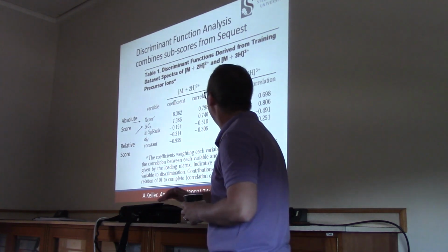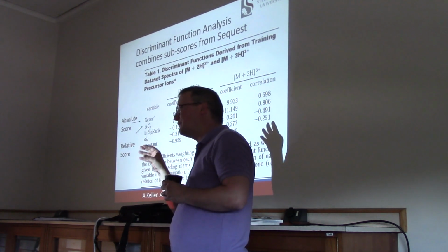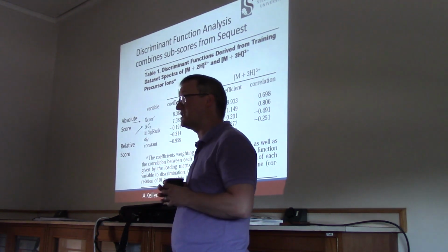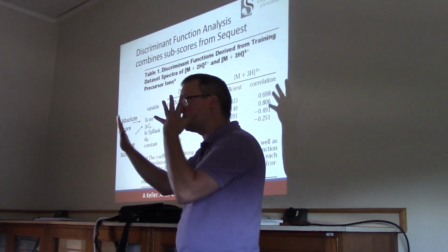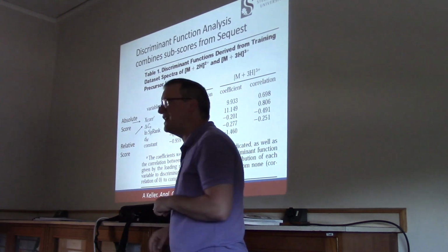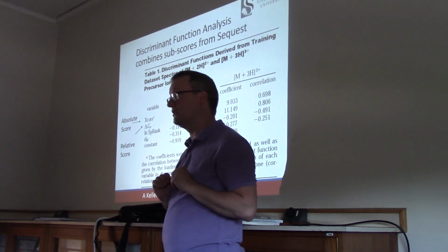I'm aware of this. All right, so Sequest is a database search algorithm, and it outputs several different measures to say how much it liked this peptide sequence versus that spectrum. We have the XCorr score that represents the rubbing of one spectrum past the other, how much that spike stands out from the hairball. It has a Delta-CN score, which represents how much better the best match is than the second best match. That's important too.